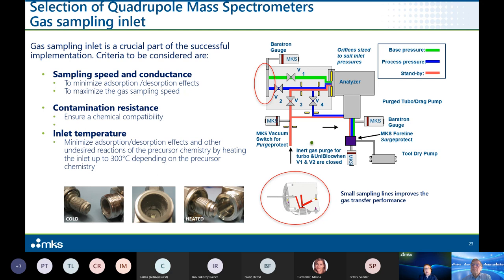In our case, we decided, let us split that high pressure range into a bypass path where maybe about 99% of the gases goes directly into the pumping system. And by that, we can make that orifice significantly bigger because we have here one stage of pressure reduction and here we have another stage of the pressure reduction.